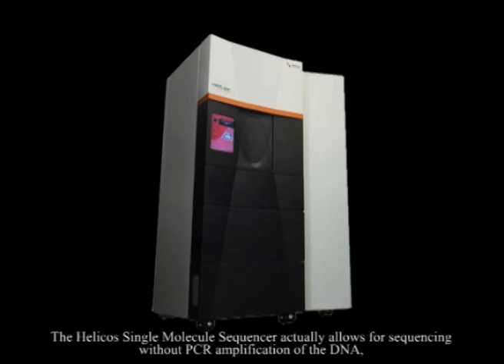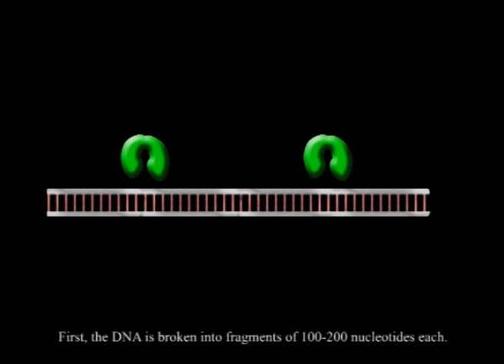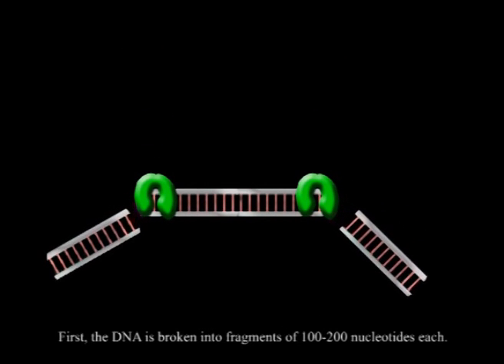The Helicos Single Molecule Sequencer actually allows for sequencing without PCR amplification of the DNA, enabling shorter preparation times while decreasing the chances of error. First, the DNA is broken into fragments of 100 to 200 nucleotides each.